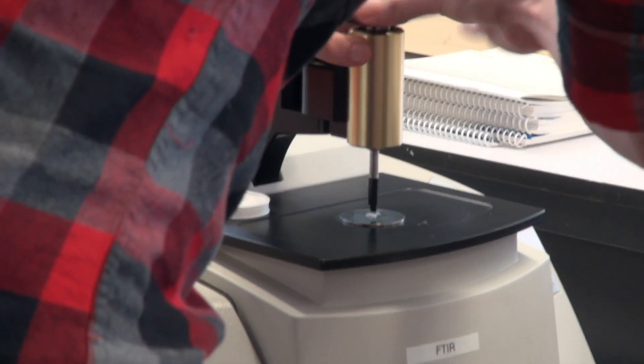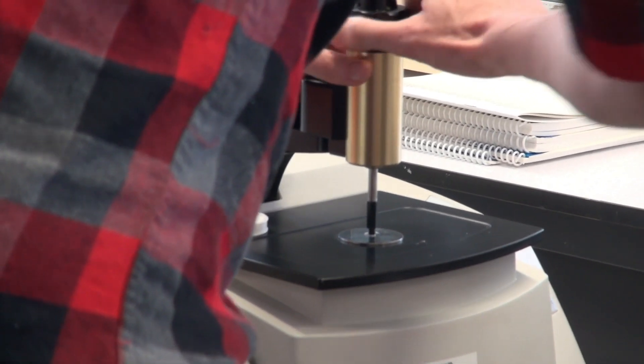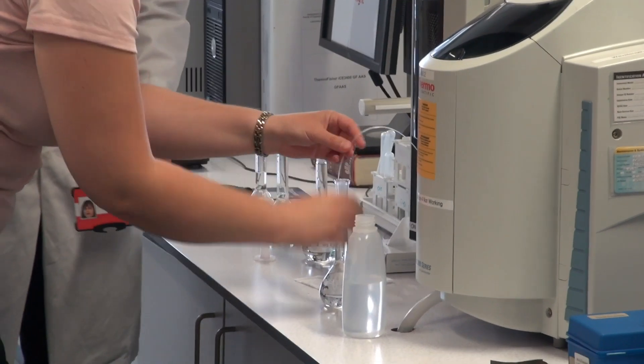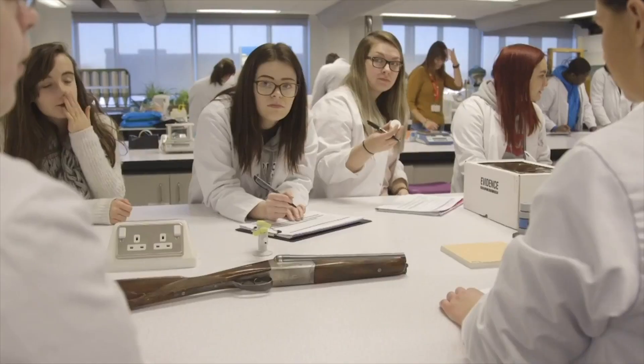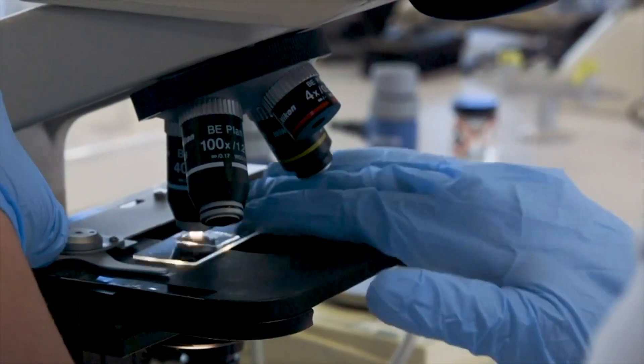In the first year they're analysing suspect powders for example using infrared spectroscopy. Then in the second year they spend a lot of time in here. We have a module called Methods of Chemical Analysis where they look at lots of different forensic scenarios and how all the instrumentation in here can be used to analyse different kinds of forensic evidence.